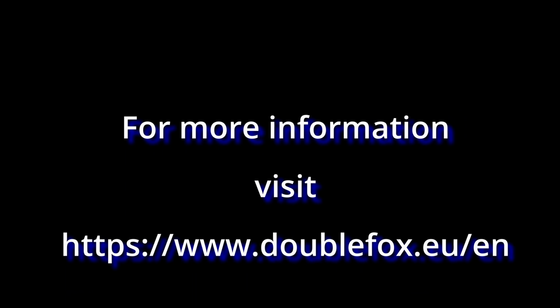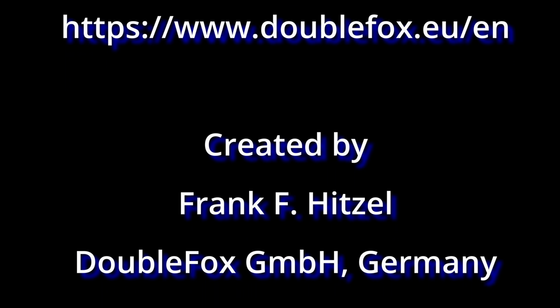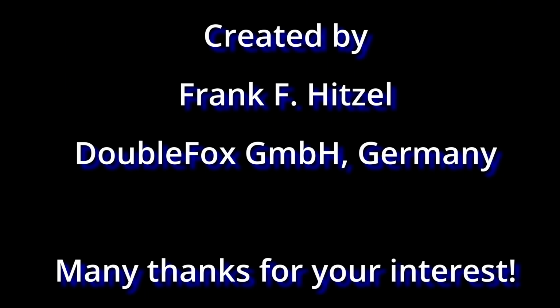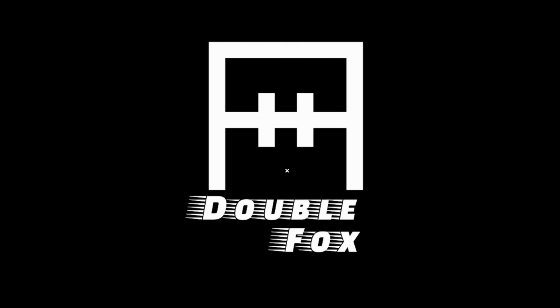Many thanks for your interest. You have seen that for simple automation tasks like localizing an area of interest and performing a width measurement, no programming is required. And with the new code generation functionality, all steps can be interactively defined.